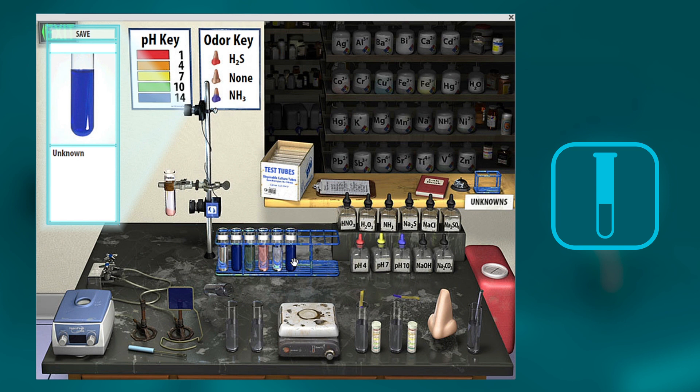Now let's test and see what you have in this tube up here. What were the steps we did for that? The color changed. Have you seen that before? Turn off the heat. Add nitric acid. Centrifuge. Decant.